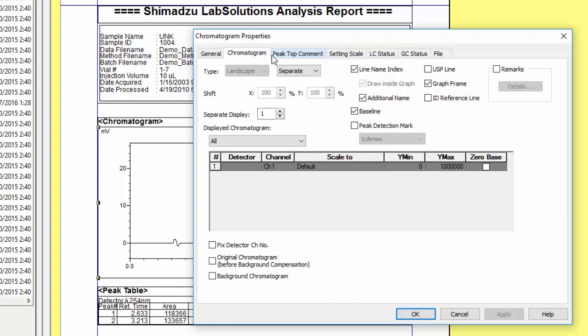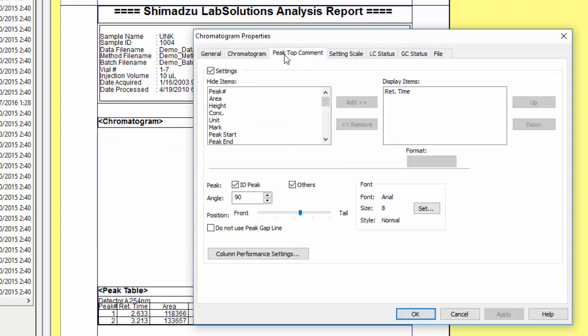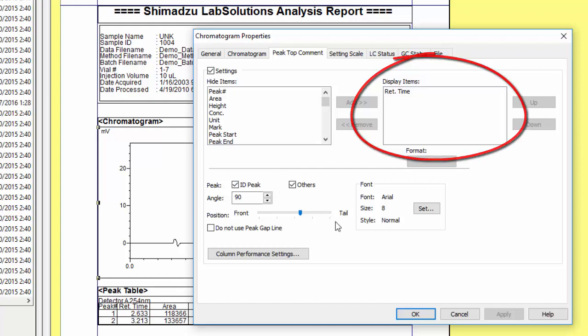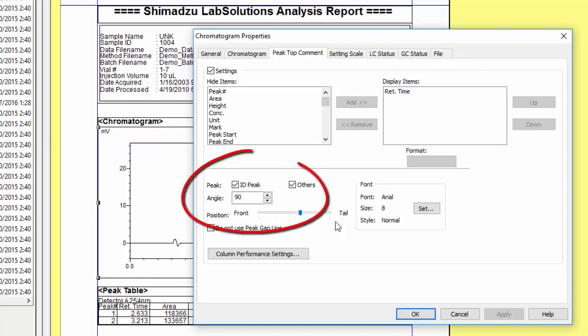Next, under the peak top comment tab you can specify what peak top comment or comments you would like to be displayed. By default the retention time is selected. You can choose to add or remove any option for the peak comment listed in the left column. Additionally you can also adjust the angle at which the peak comment is displayed as well as the font style and size.